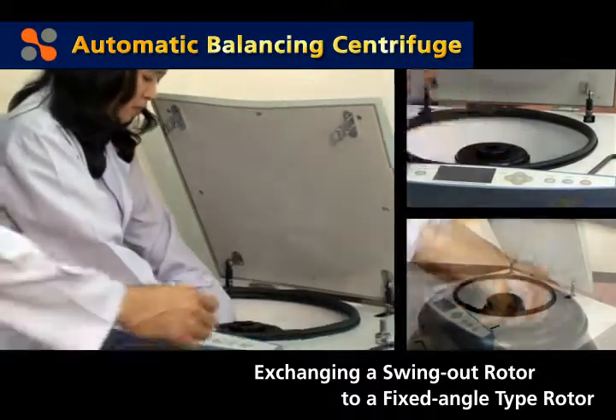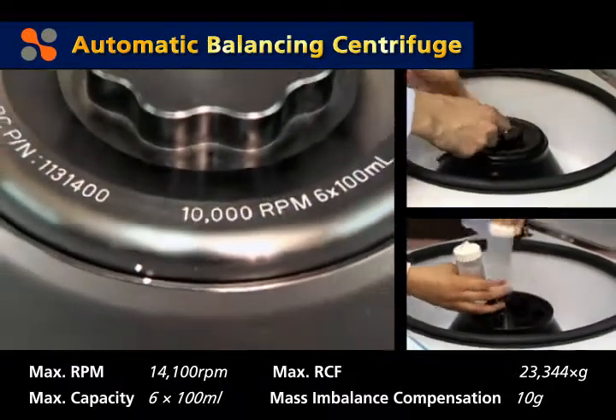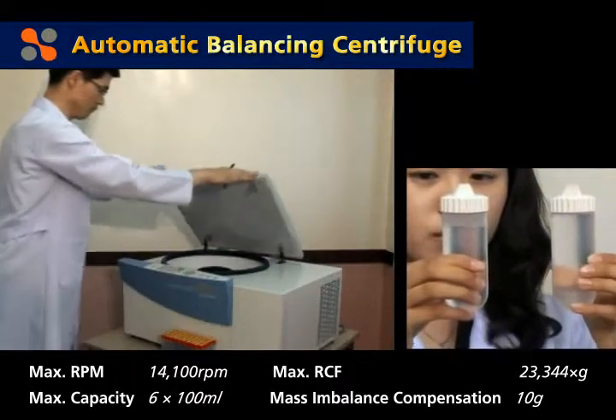Maximum volume capacity for the fixed-angle rotor is 600 milliliters — 6 bottles of 100 milliliters each. Though there may be a weight difference of up to 10 grams among the samples, they can be balanced automatically.